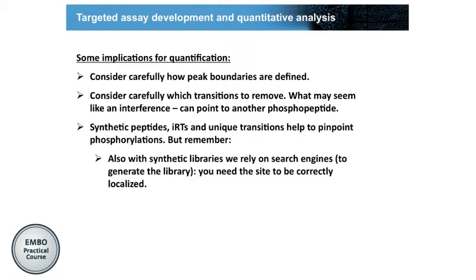And what I would also like to stress is that even when you're using synthetic libraries, and you go through the pipeline that we showed you, where you first do SRM-triggered MS2 or any other type of workflow, and then you go to a search engine, we already talked about it on the second day. Sometimes the search engine will give you a mislocalization compared to what you actually injected, and then you need to see how to adjust the PEP-XML so that it is correctly localized or not. So you need to try and understand, and sometimes you will not get a phosphopeptide into your library simply because it didn't come up from the search engine as the correct localization, meaning correct as the one you ordered. That is what I refer to.